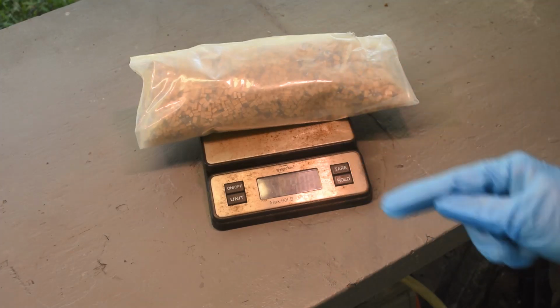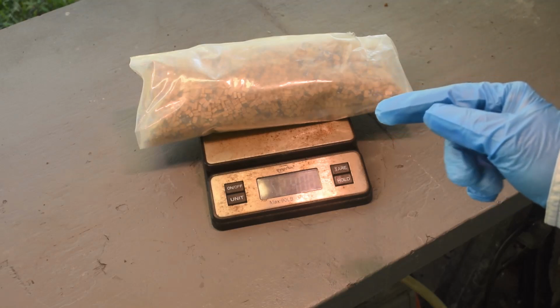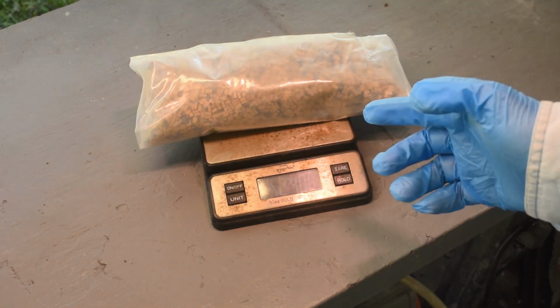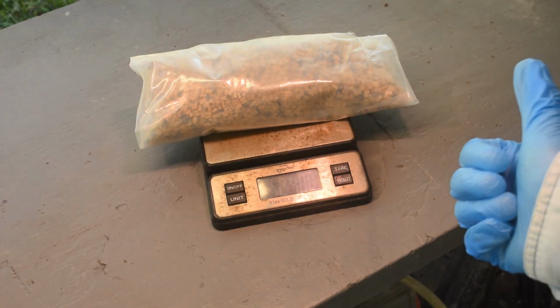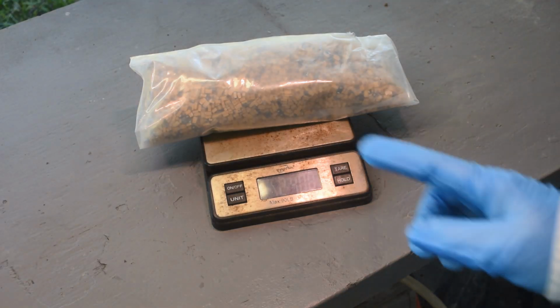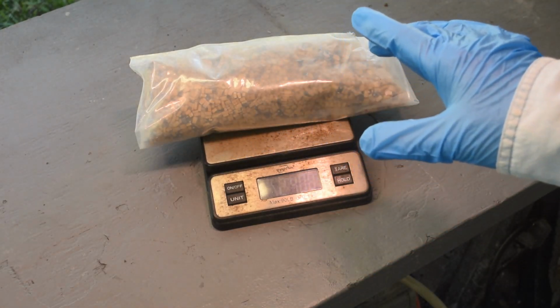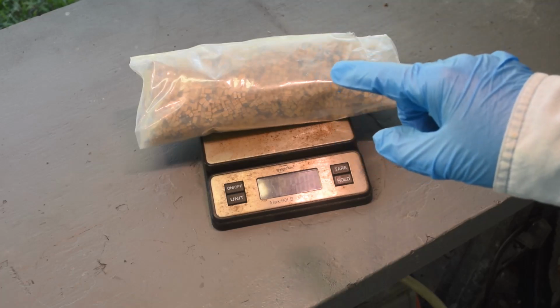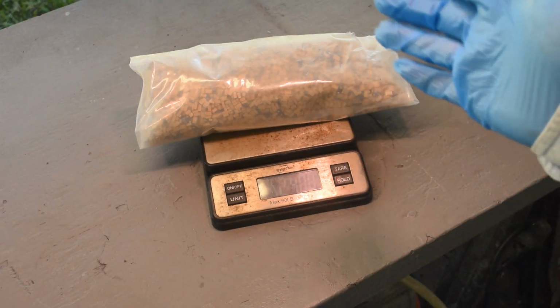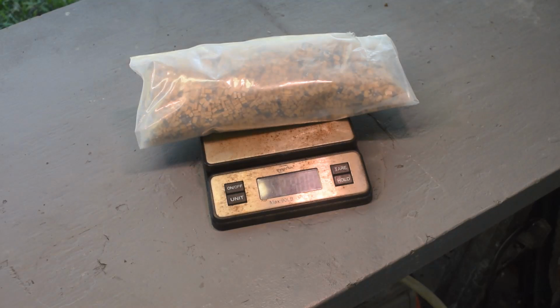But we're going to do a little bit more careful with the gravity separation anyway, just to make sure I don't lose any silver. And then we'll be able to get what's left after that into 2 big beakers in the fume hood, and we'll treat it with 2 different acids and see what process works better. We'll get rid of all this iron and steel in here, nickel, and then we'll switch over to either nitric acid or poor man's nitric, which I might do one half one way and the other half the other way, and get rid of the copper in here, and then we start dissolving the silver and recover the silver.